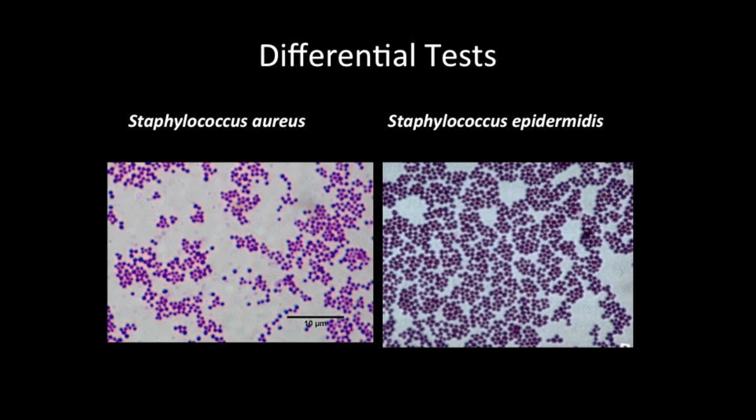If we were to gram stain these two species, we would find that both are gram-positive cocci that grow in clusters. If we were then to acid-fast stain these two organisms, we would find that both are non-acid fast. So with each of the differential staining techniques, they appear identical, making it difficult to differentiate the two species. To aid in identification of bacteria to the species level, we must employ other tools in the lab.